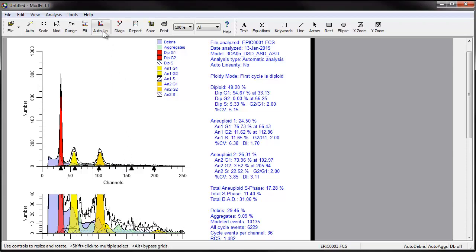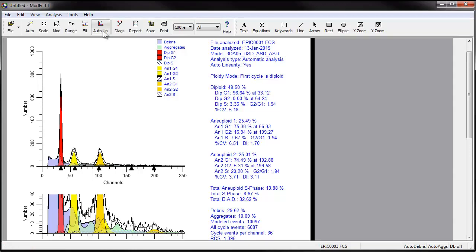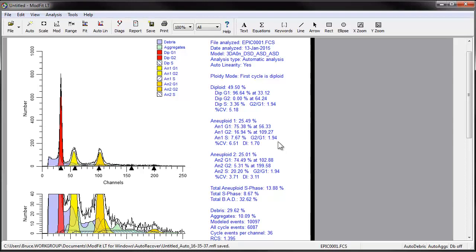Click the autolinearity button on the main toolbar to trigger the autolinearity and analysis sequence. It's actually very fast. After it has completed this analysis, it refits the histogram with the optimized linearity setting. For this example, the optimized linearity setting is 1.94. The aneuploid S-phase was 11.66% and is now reported as 7.67%, and the RCS is even lower at 1.395.